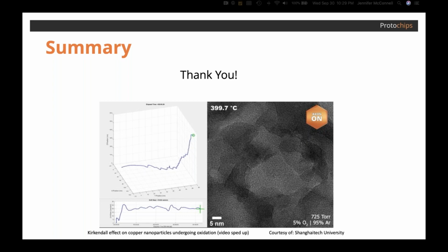If that tagged section is a matter of minutes, it could be only a couple of single gigabyte file sizes. If it's 30 minutes, an hour, it could be in the tens of gigabyte file sizes. So in general, probably tens of gigabytes, which is certainly a much more manageable size file than the hundreds of gigabytes or terabytes that people are used to. Perfect, thank you. Let's do one more quickly. Can you clarify further the internet connection that's needed in my lab for AXON?